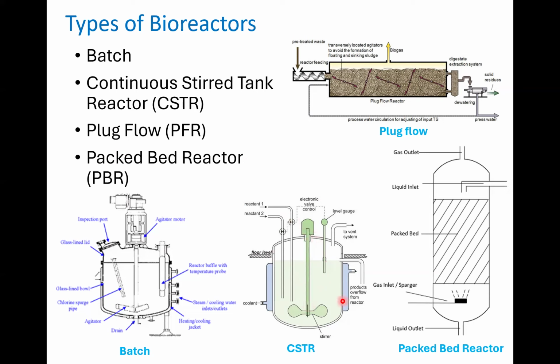Of course, you can have whatever type of heating or cooling. Sometimes you have to have some kind of controls too, depending on what accessories you have. You can also have a mixer. You can have a mechanical mixer, or liquid recirculation as mixing, or if you have a gas headspace, you can use the gas as a mixing medium.